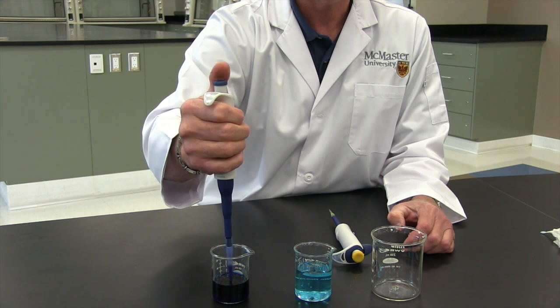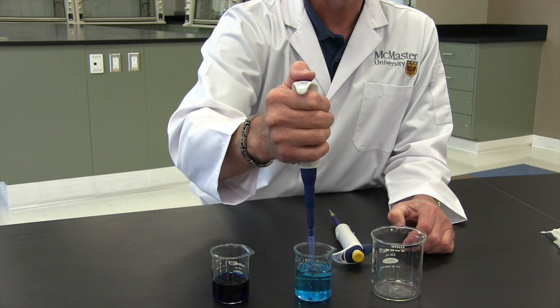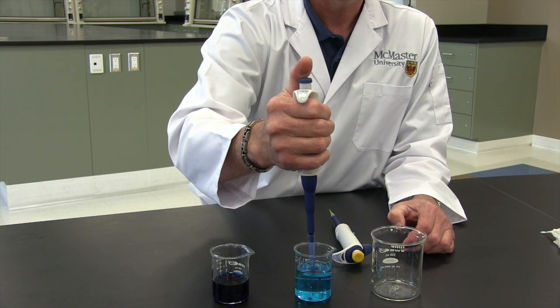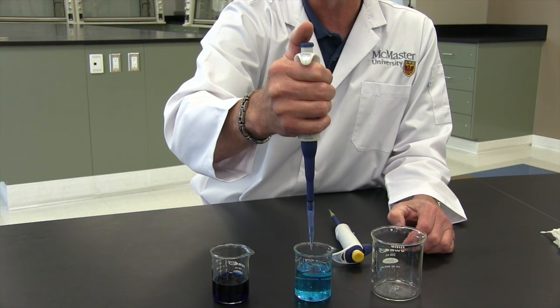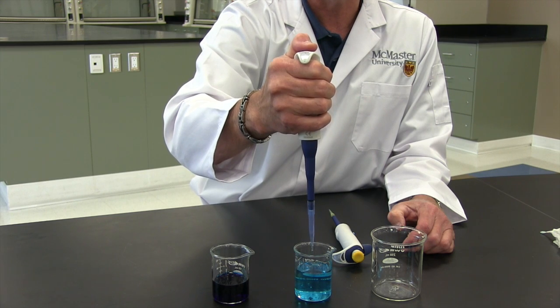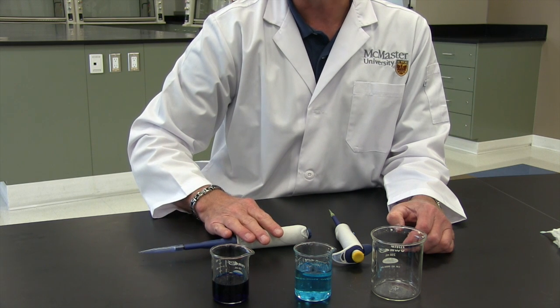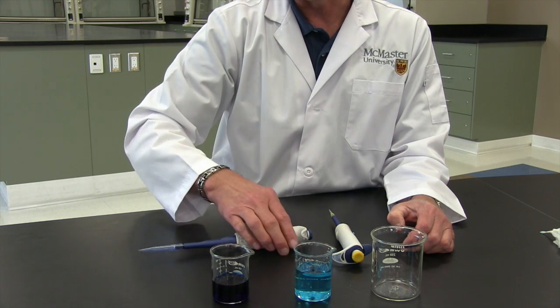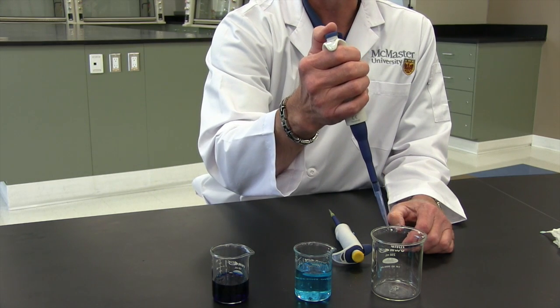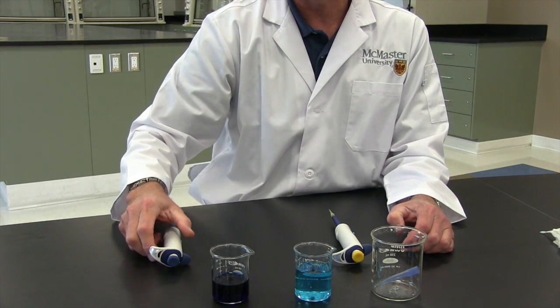Another error is when you're dispensing the liquid and you press it down and then release your thumb before you take it out of the liquid and you end up drawing up some of the reagent or the chemical that was in that second beaker, and you don't want to do that as well. You should avoid putting your micropipette down on the bench top while there's still a tip on the end, because it has a chemical on it and people may run into it or it may drip onto your work area. You should always get rid of your tip as soon as you're done with it.